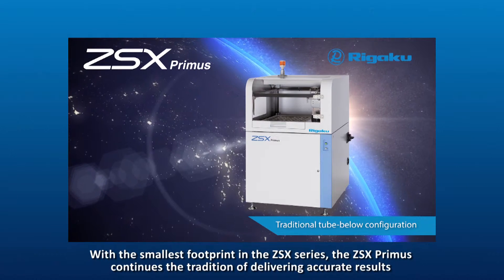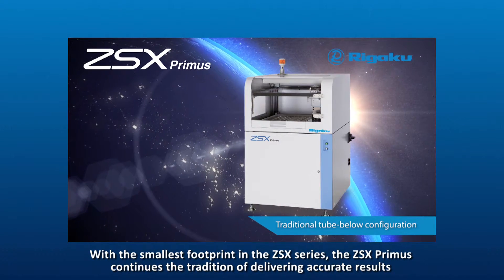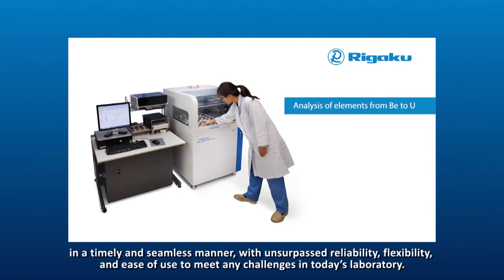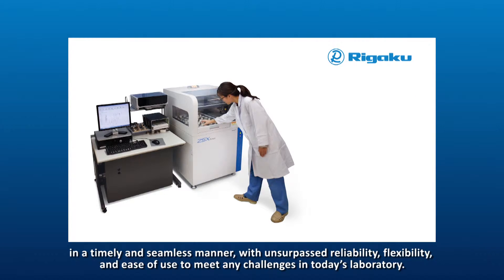With the smallest footprint in the ZSX series, the ZSX Primus continues the tradition of delivering accurate results in a timely and seamless manner, with unsurpassed reliability, flexibility and ease of use to meet any challenges in today's laboratory.